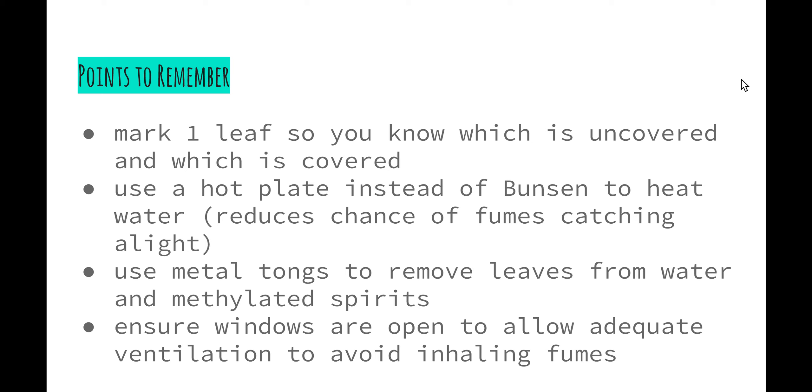Use metal tongs to remove the leaves from the water and the methylated spirits—obviously not our hands, we don't want to burn them. Methylated spirits has a very low boiling point so it gets very hot quite quickly. Ensure that the windows and doors are open to allow adequate ventilation to avoid inhaling the fumes as it can make you quite dizzy.